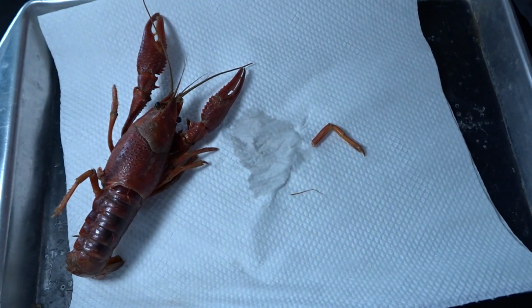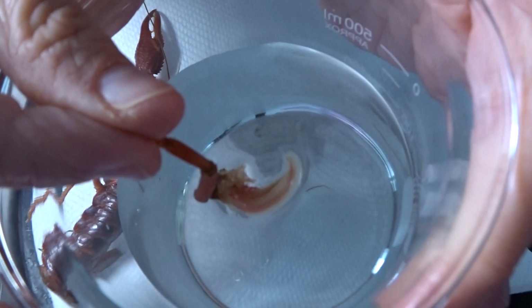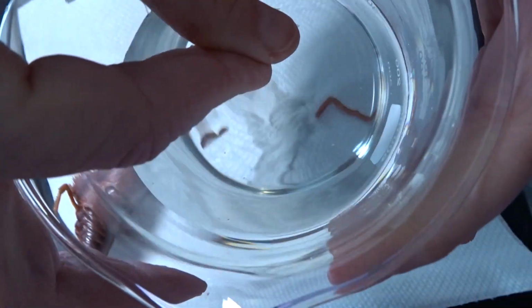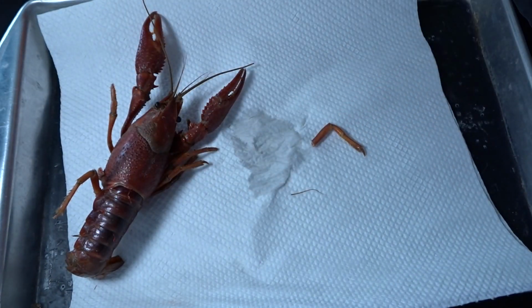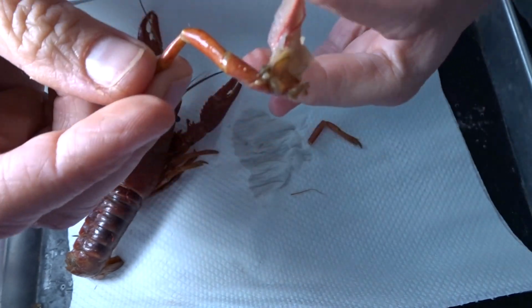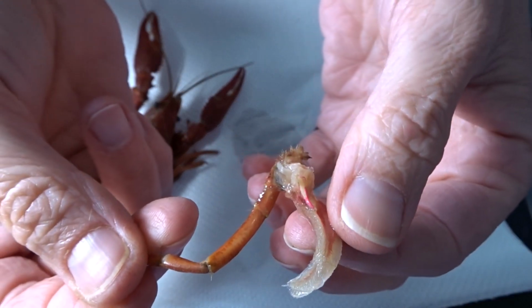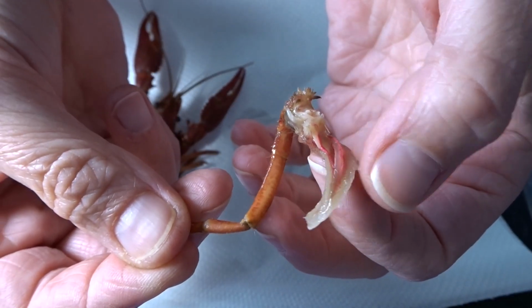Let me show you something here. See if I can get you to see it. It really does fan out. It's hard to see, right, through the video here. It's not a very good quality, but it fans out. And if you guys, this worked out really, really well. It does look like a feather. It has all of these branches, and if you see it's vascularized, right? That latex, that pink shows me that I have blood running through there.